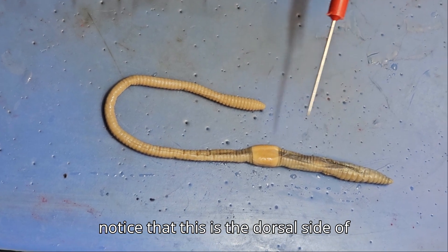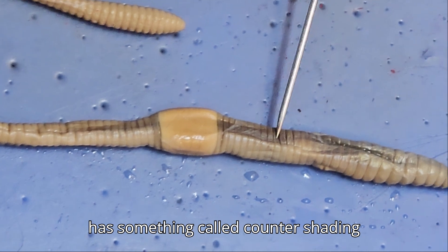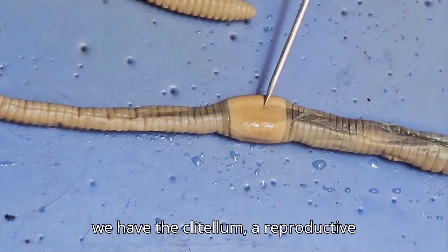Continuing with external anatomy, we'll notice that this is the dorsal side of the worm because it's darker. This worm has something called countershading where the dorsal is darker. And then here we have the clitellum, a reproductive structure.